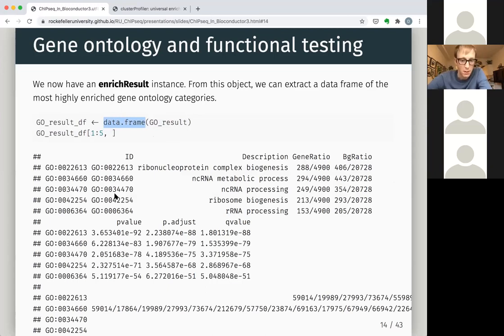And you can see you get this nice output that lists, ranked by p-value, the top gene sets that were enriched from the ones you chose. In this case, we did gene ontology biological process. And you get your p-values. You even get the gene IDs from your list that overlap with the particular gene set in that row. And you can convert these to gene symbols, sort of as we've done in this course.